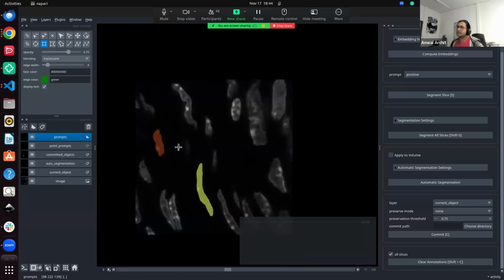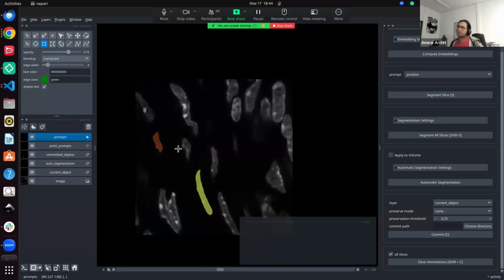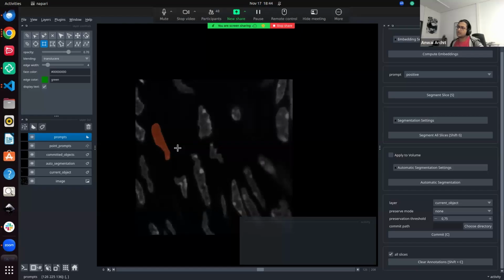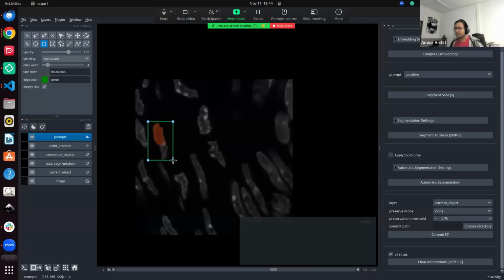Okay, it did something. And oh, okay. It kind of in one direction did a good job. Let's see the other direction. Seems like there are some mistakes. Let's fix them. Let's ignore this because I did something bad here.